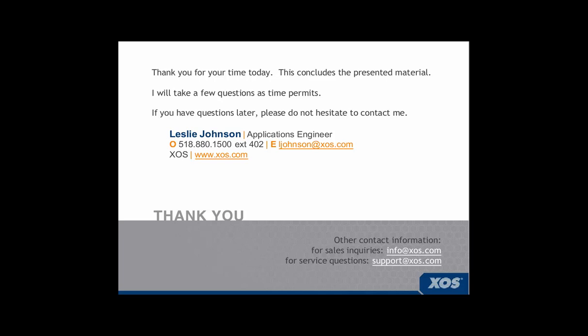And then I have another question that states, if we are going to measure less than 1 ppm, do we need to use the 0 to 500 ppm calibration, or would it be better to add some points in the range from 0 to 5 ppm? And actually, we still recommend doing the 0 to 500 ppm calibration. The analyzer is very linear, and these high points will actually help and make a more stable calibration, even for samples less than 1 ppm.